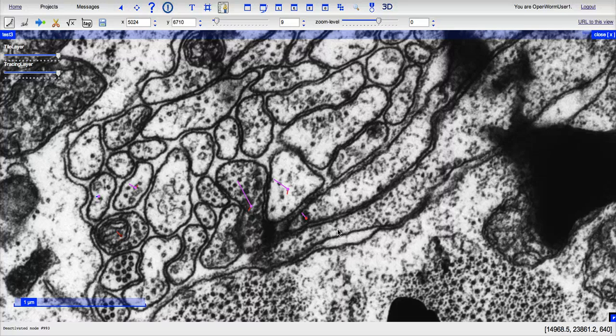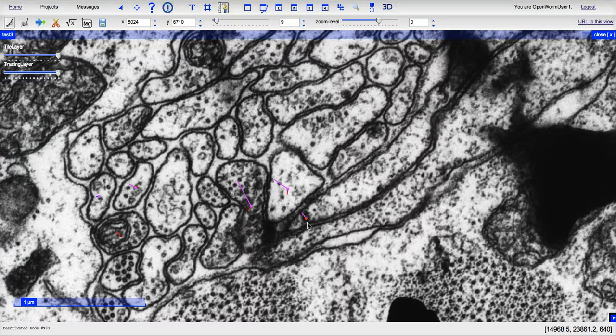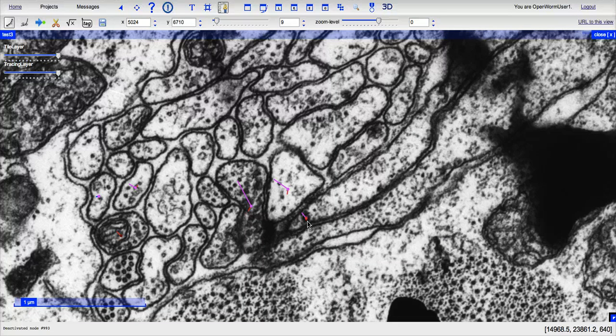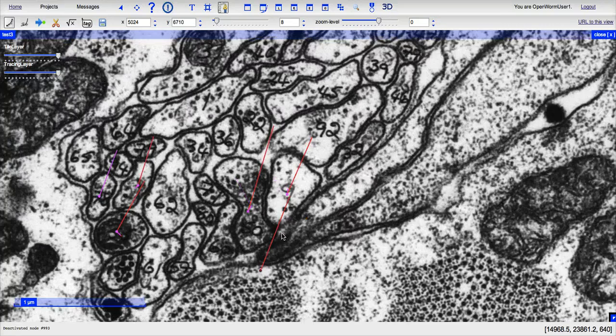Be sure to mark muscle too, and you can just mark that as a neuron for now, and when you're naming it, you can name it as muscle if you would like.